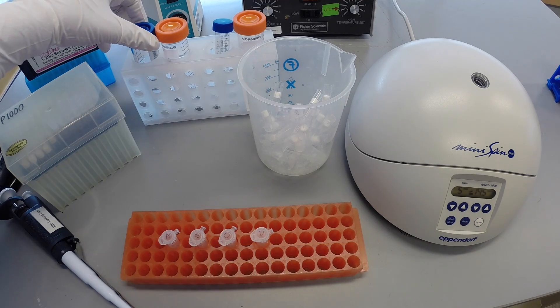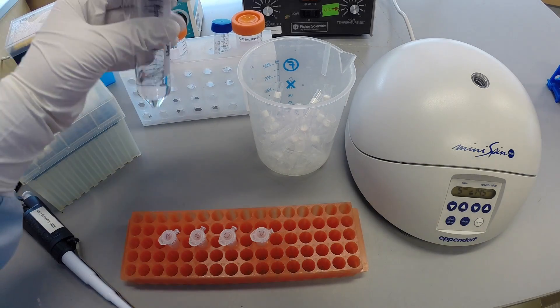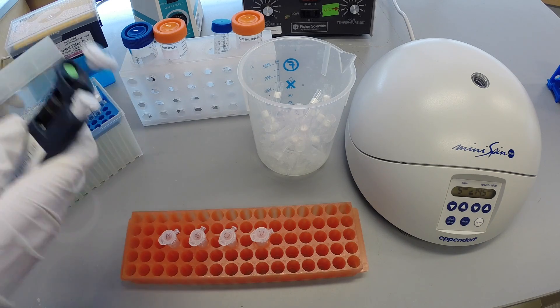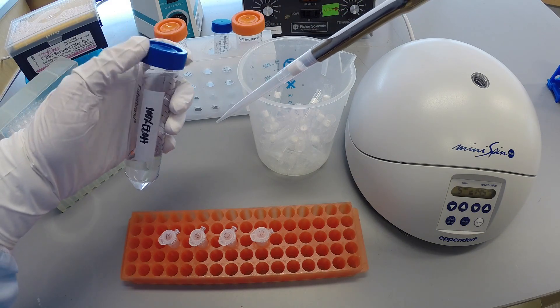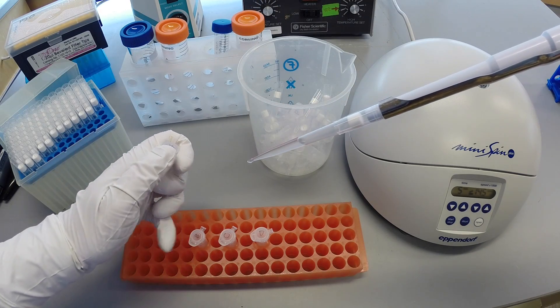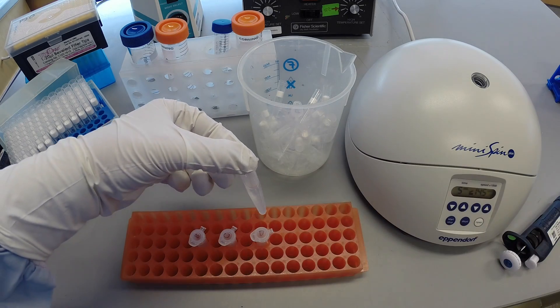Precipitate the DNA from solution by adding an equal volume of 100% ethanol to each sample, and mix by inversion 10 times. The solution may become cloudy. This is normal.